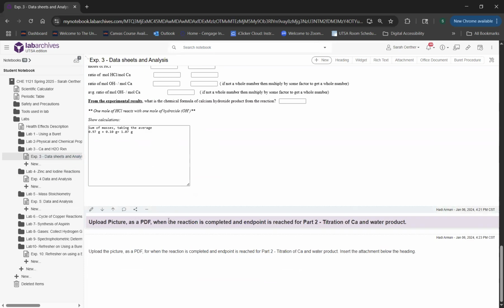If you're not sure how to submit a PDF or to do any conversions, please definitely let us know. We can help you out with that. To upload it, you're going to possibly click on this pencil. This is how we edit everything else, but this submission is going to be a little different.